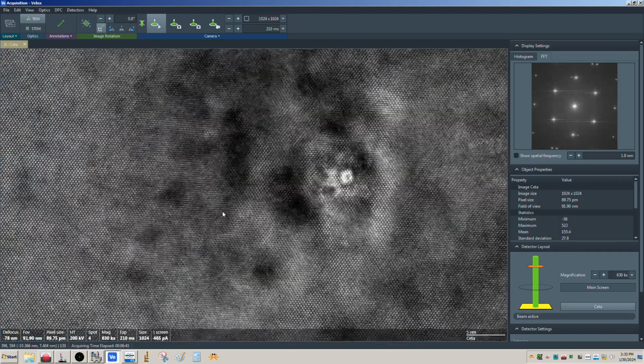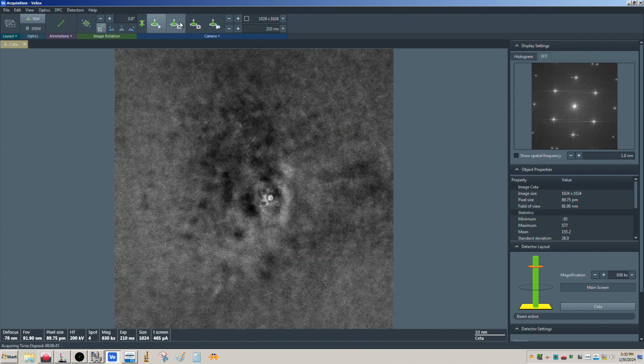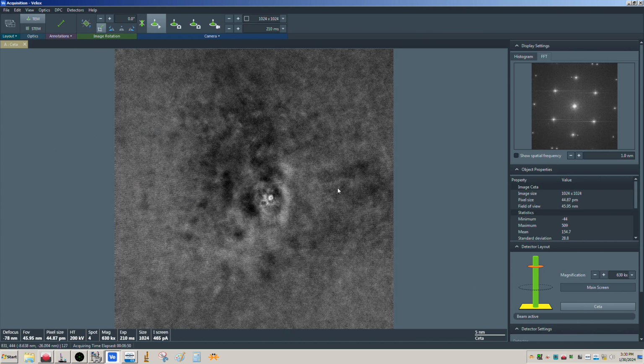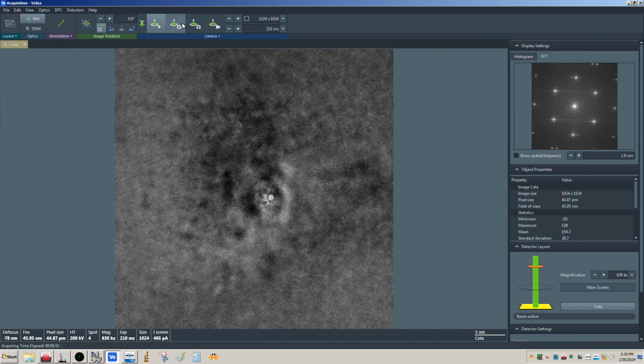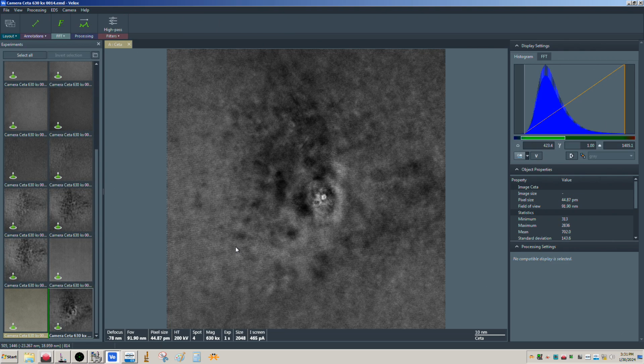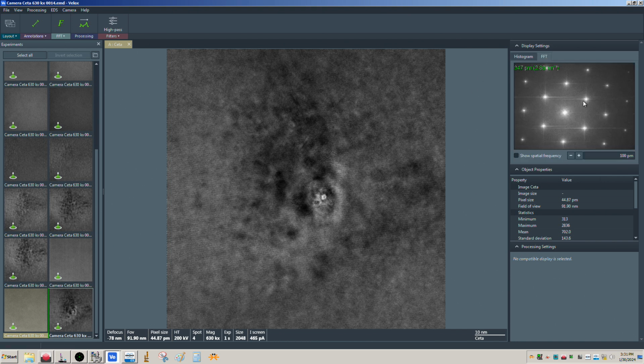I'm just using the scroll wheel to digitally zoom here. Let me put this back to 1 second, because otherwise 10 seconds will be too much. Okay, there we go. So I guess the question is, can we see now? One thing you can sometimes see is the effect of this in the FFT.